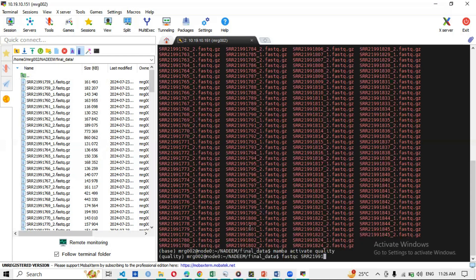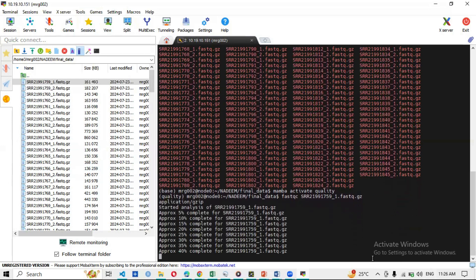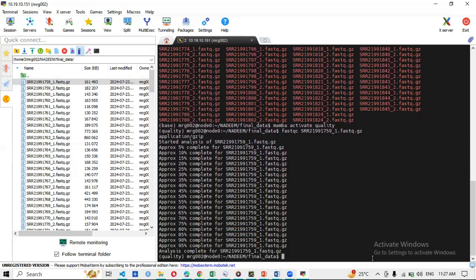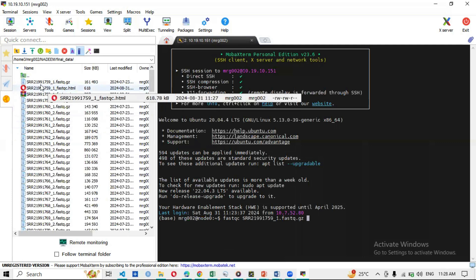Now I'll run FastQC on a single file. I type 'fastqc' followed by the accession number of the file — in this case SRR2211759 — targeting the first read. I press Enter and it starts analyzing. It shows 'Starting analysis of SRR...'. Because I'm on an HPC it is quick; on a Core i5 or i7 it might take two to three minutes per file.